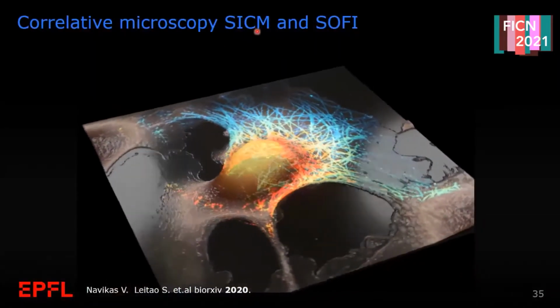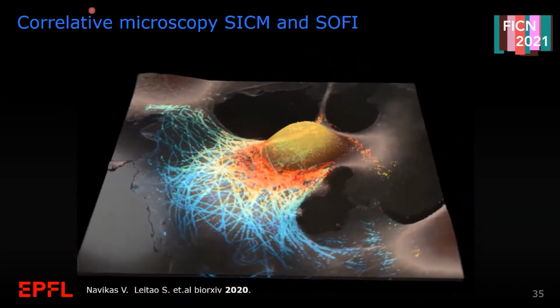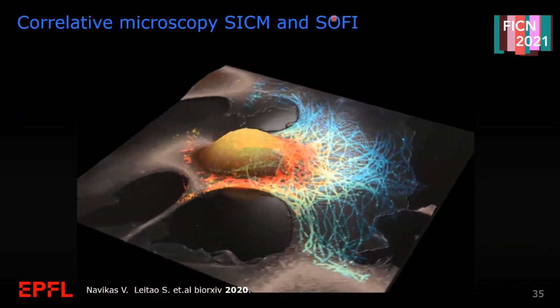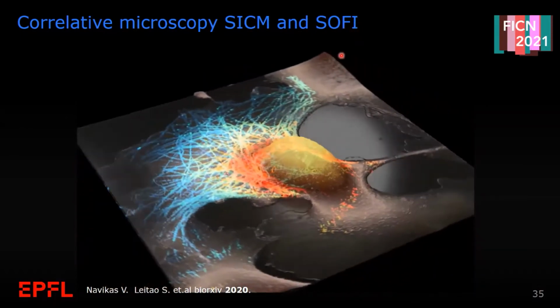So now I would like to transition to our third story, which is correlative microscopy using scanning ion conductance microscopy and one type of super resolution modality, which is called SOFI.